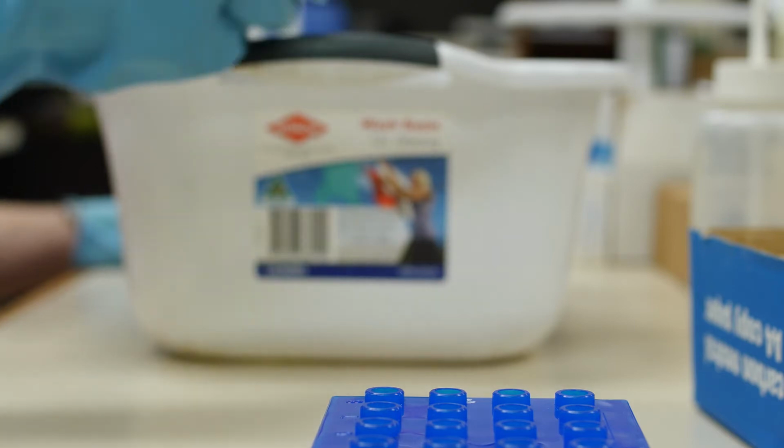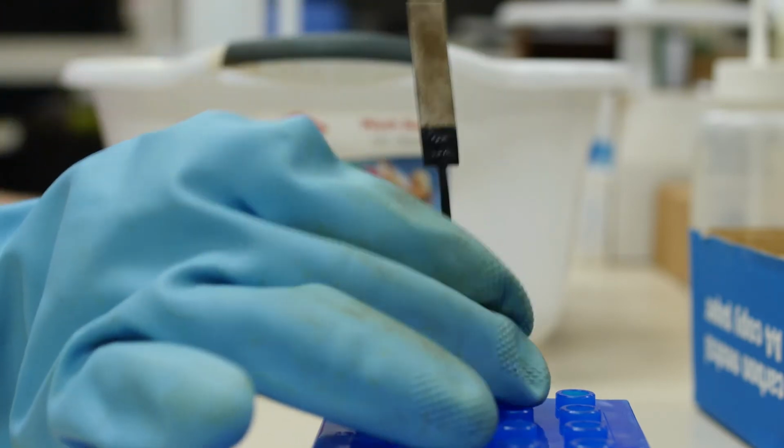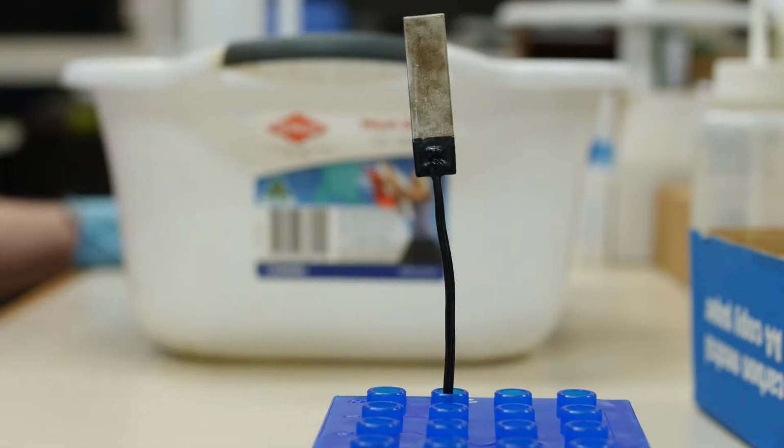Once a coupon is clean, it can be moved to the drying rack. After a few minutes in the drying rack, the coupon is given a final thorough drying with a hairdryer set to medium heat.